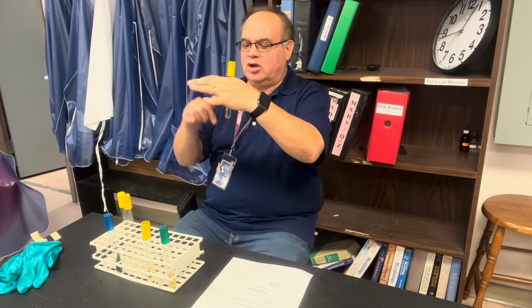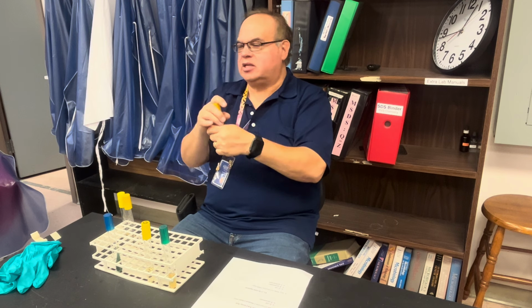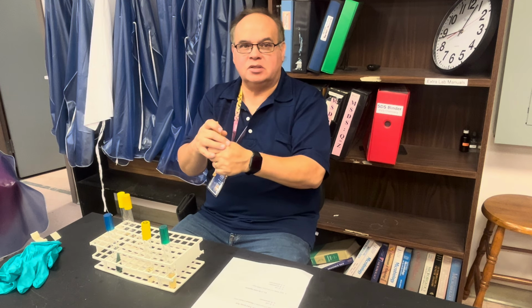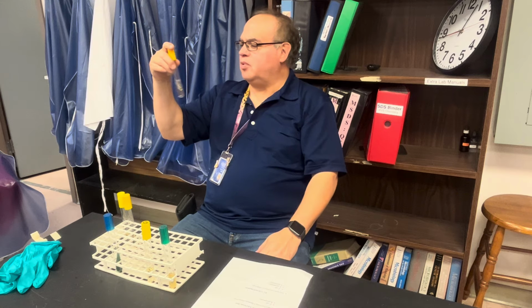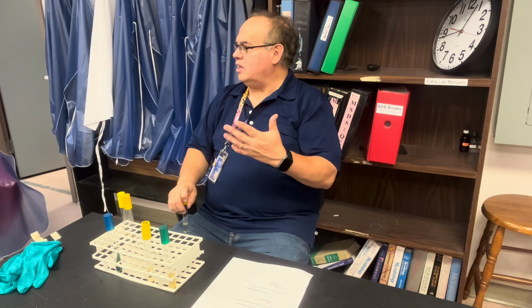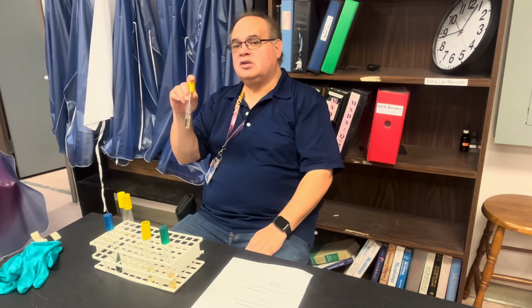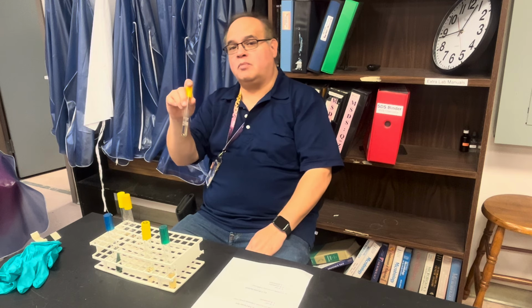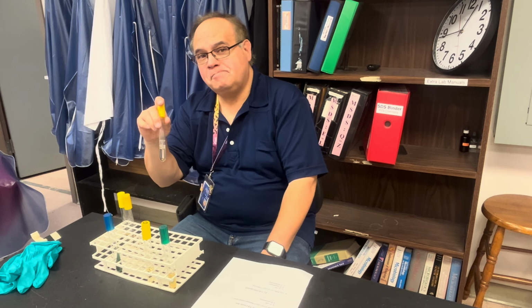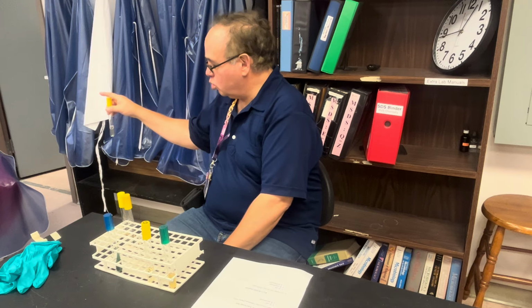So you're going to add it in here. It's going to speed up the reaction. It's still going to take about 5 to 8 minutes. But it's going to turn a deeper red. It's going to be like burgundy. Are you with me? That means it's positive for the production of neutral end products. Okay? So when it turns burgundy, it's positive for neutral end products.